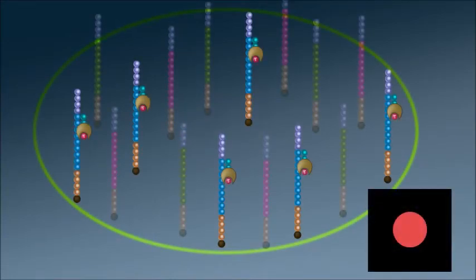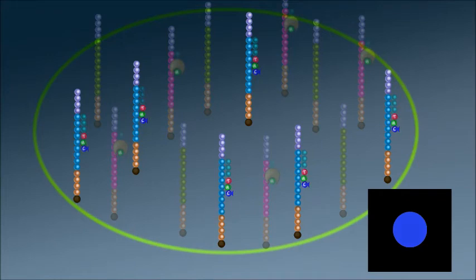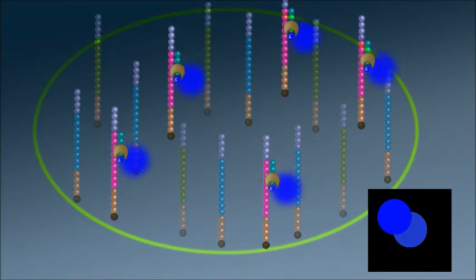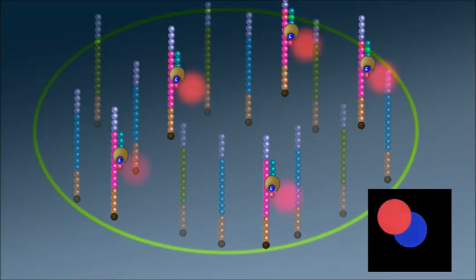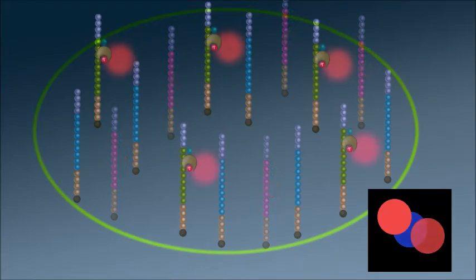Sequencing simultaneously occurs in all single-molecule DNA copies from the same cluster. For example, here the barcode 1 cluster. Different barcode clusters corresponding to the other subunits 2 and then 3 are then sequenced one by one.